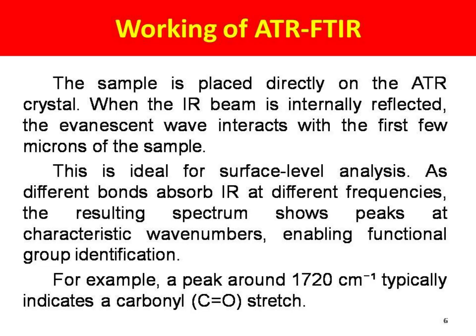The working of ATR FTIR: initially the sample is placed directly on the ATR crystal. When the IR beam is internally reflected, the evanescent wave interacts with the first few microns of the sample.